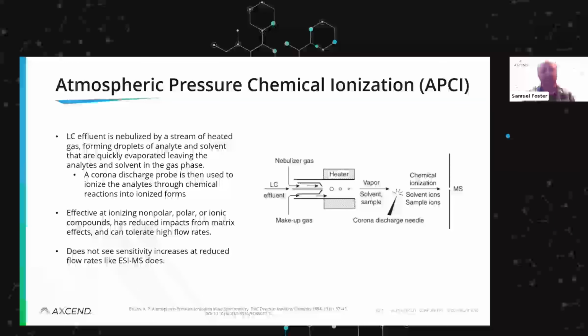So I want to pause here for a second. We've talked a little bit about each of the different ways that we can filter these masses, but what we have to do to start with is actually get these masses into the ionization phase. And so I want to put up a poll for everyone to ask, let's see, what types of ionization sources are you familiar with? We're going to go through a couple of these, specifically APCI, ESI, and MALDI, their benefits, their drawbacks, and how they're impacted by capillary scale. Then we will get further into some of these applications.